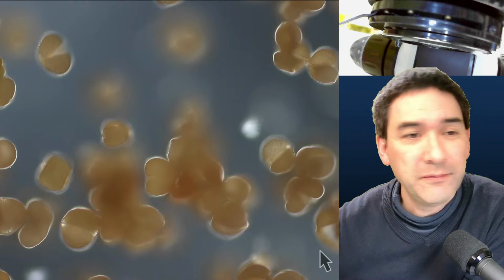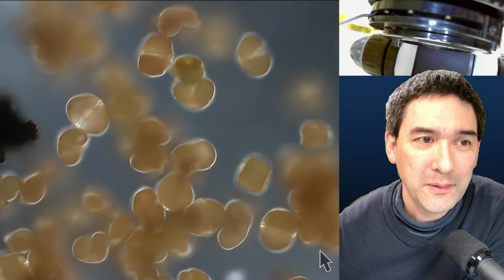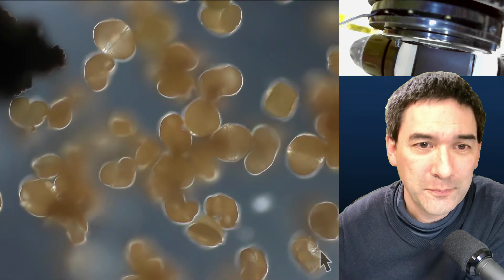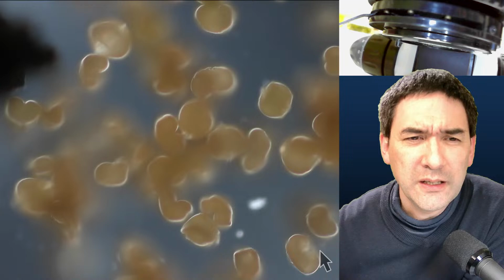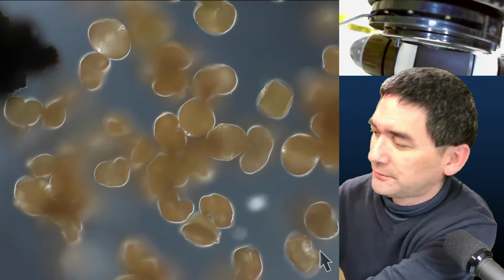Again, I don't have my flashlight here, but you could actually illuminate them also from the top. There is some dust and dirt as well from the collection of the pollen. I think, if I remember correctly, these are spruce pollen. But I'm not quite sure. That was a couple of years ago.